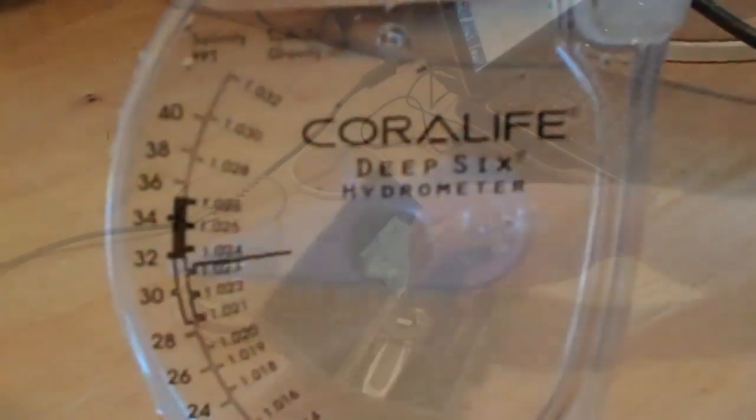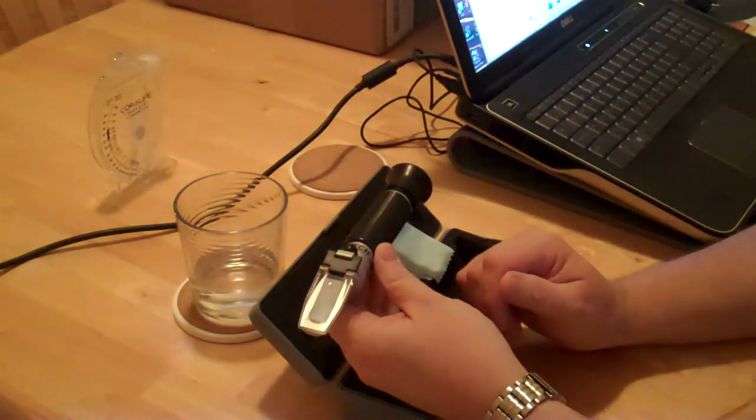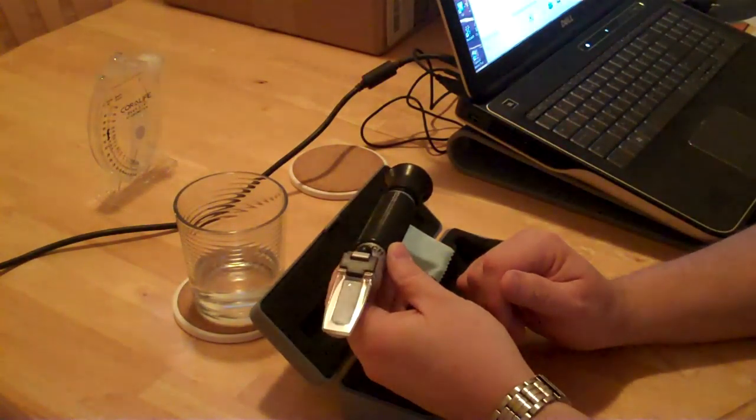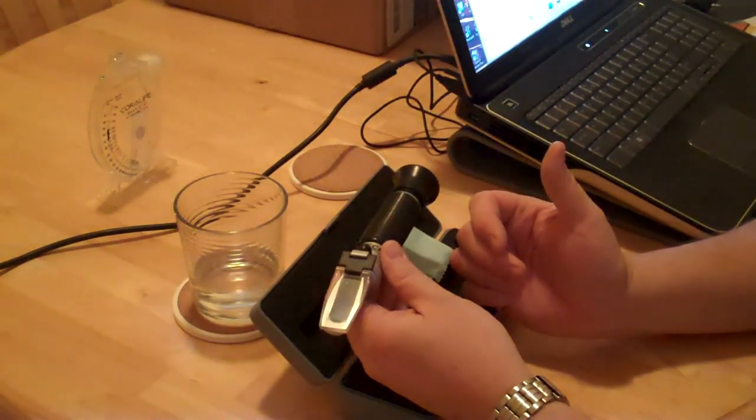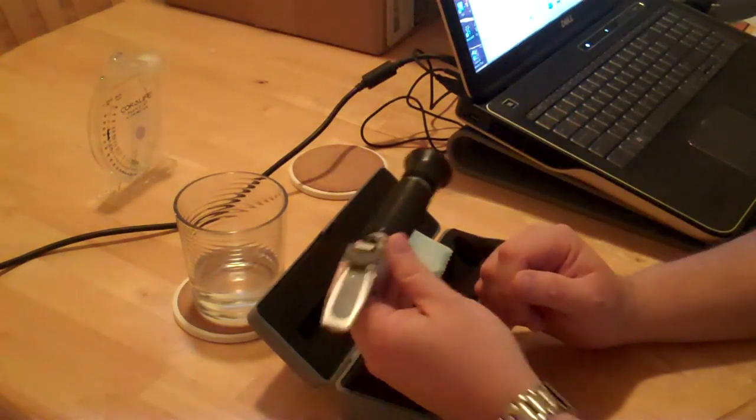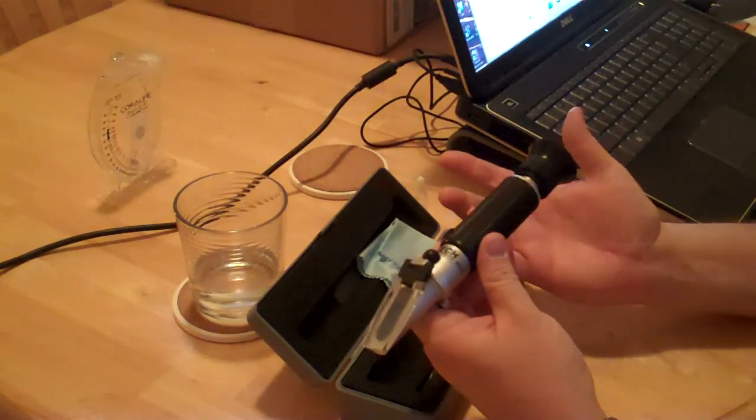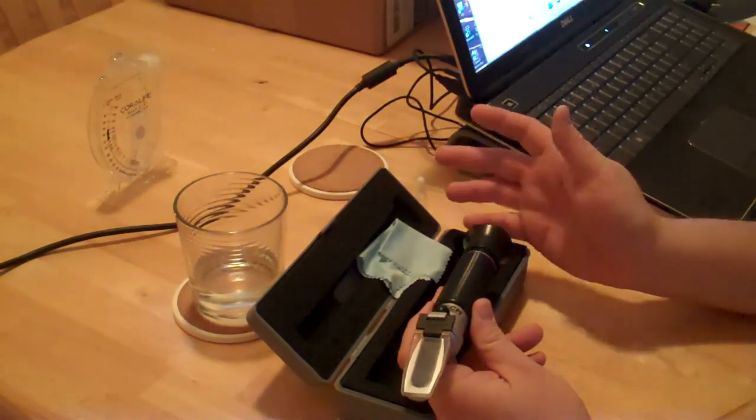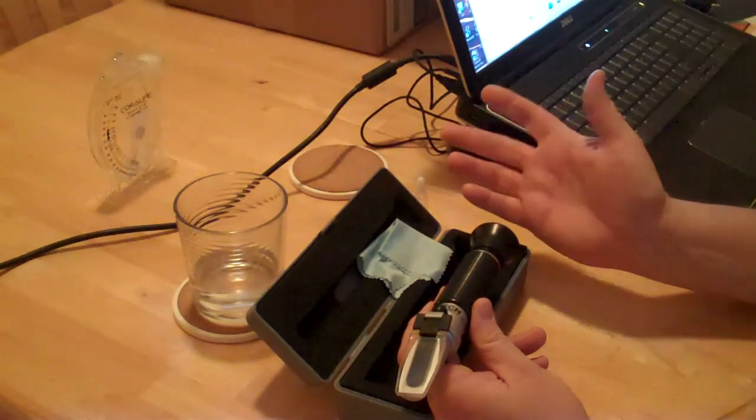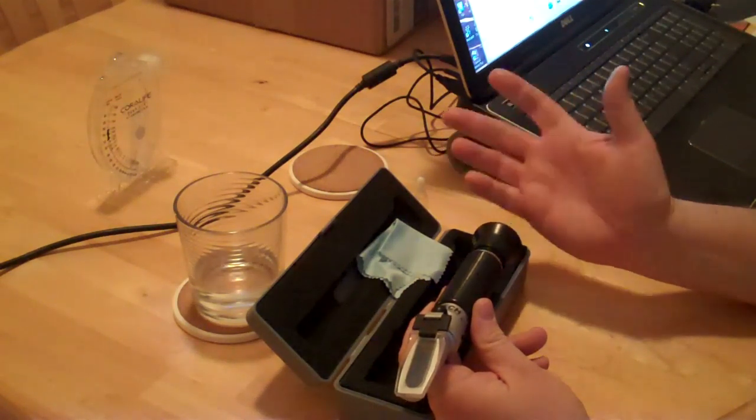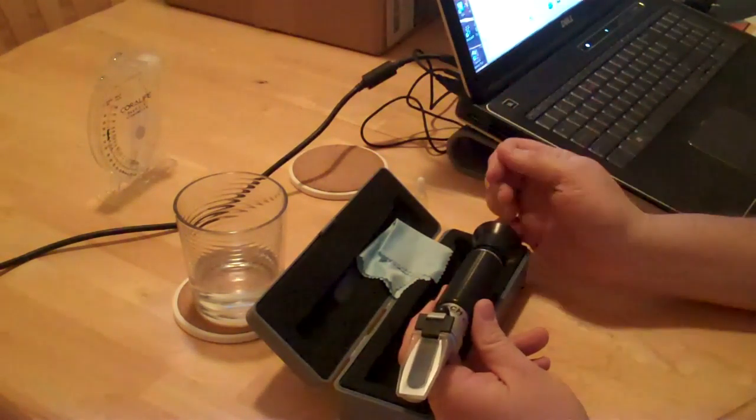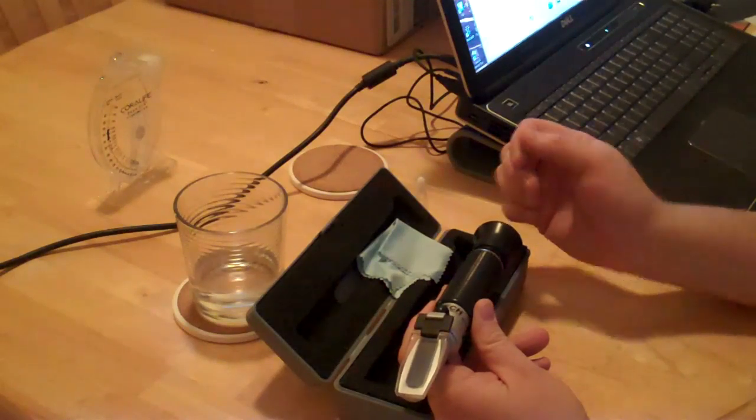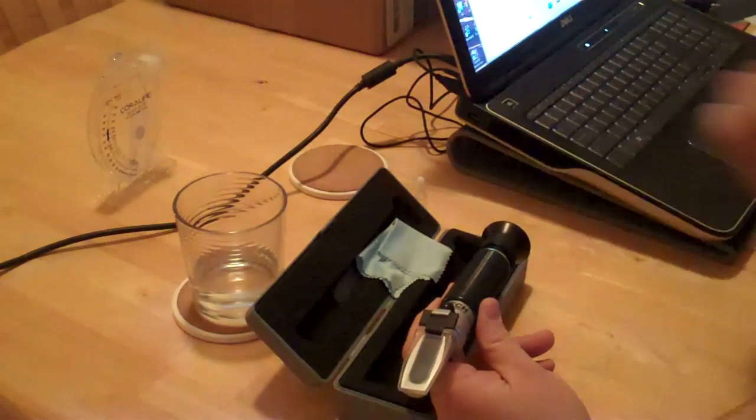This is a refractometer, an instrument made for measuring the salinity or specific gravity of salt water. Very easy to use, very accurate. I was told by the guy at the pet store that eventually I would want one of these if I start making my own water. So I ordered it off Amazon, 50 bucks or whatever.